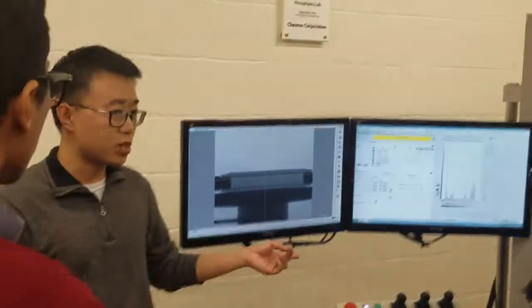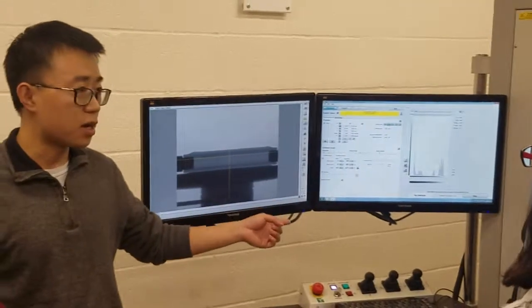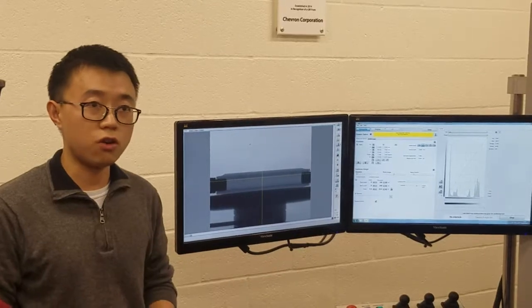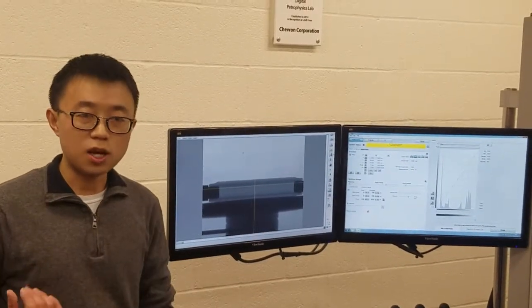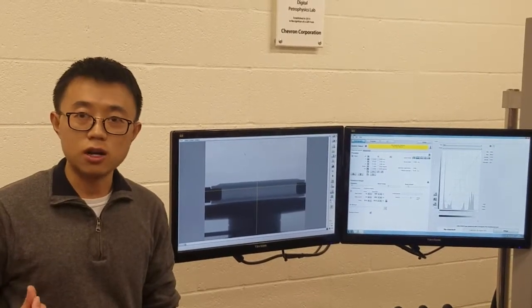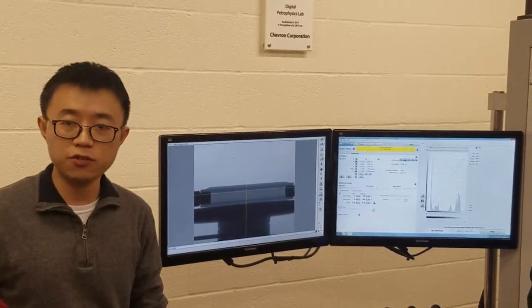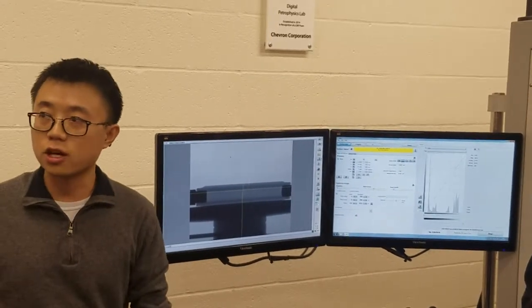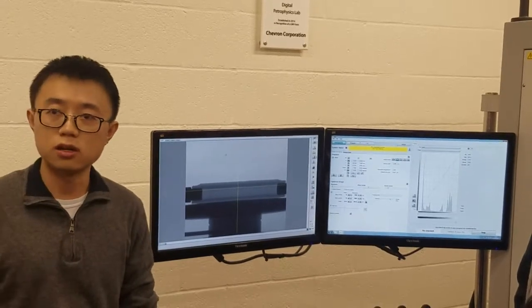One is that during the scan, it can reconstruct using the software over here, but it can only export a single volume file, which can only be read by some commercial software like Volume Graphics or Avizo. But if you want to export as an image stack of TIFF images, you need to import the data from here and create TIFF image stacks. But yeah, it's pretty well supported.